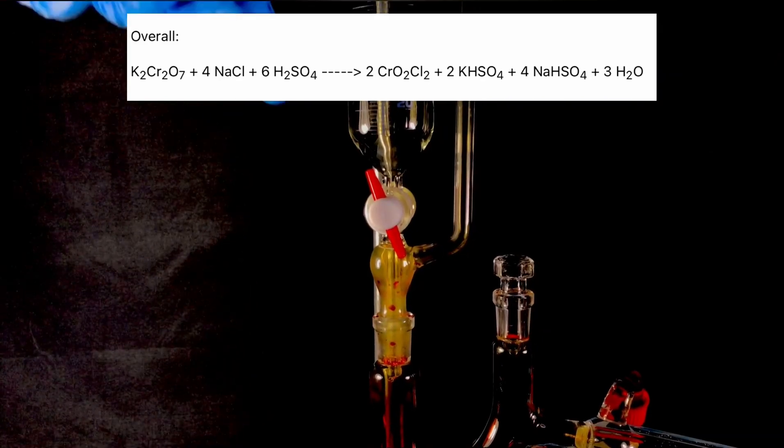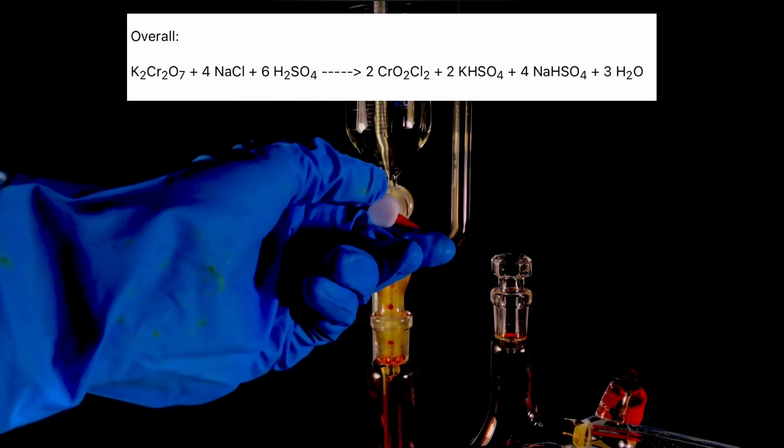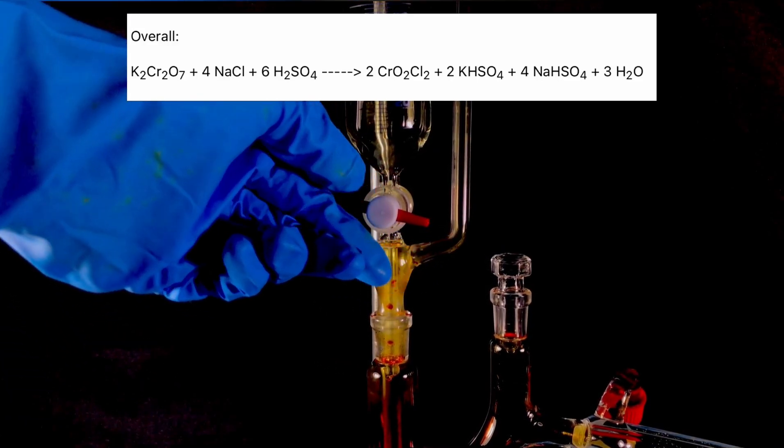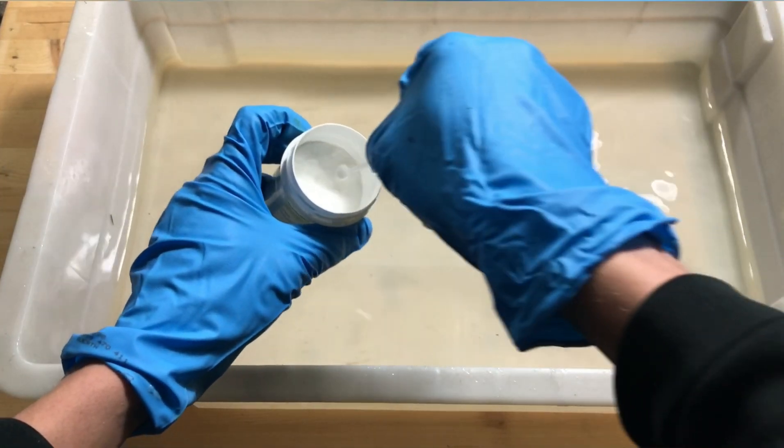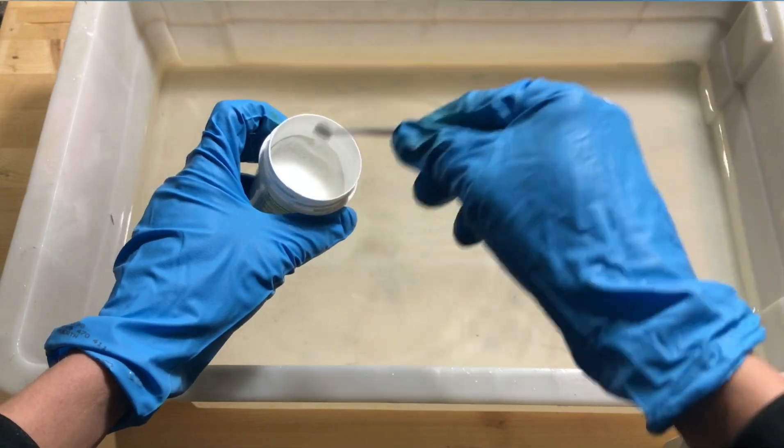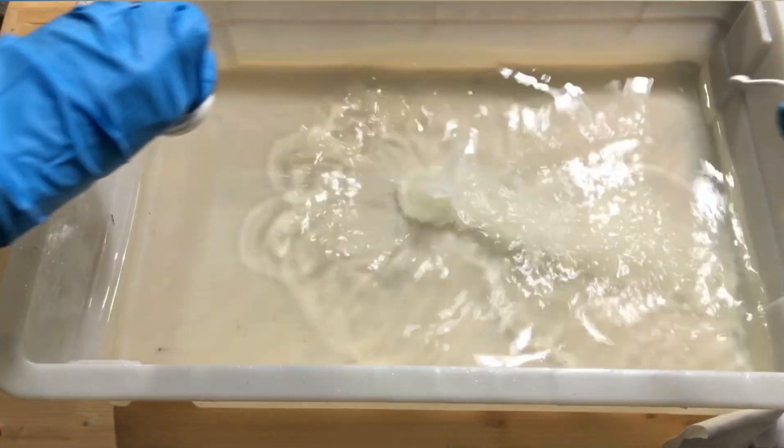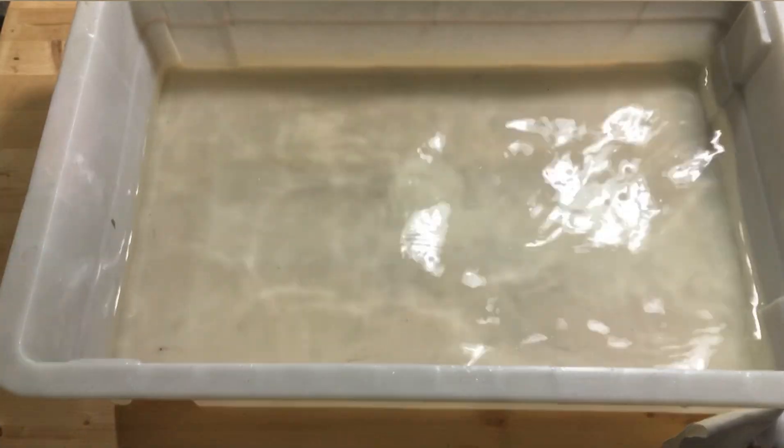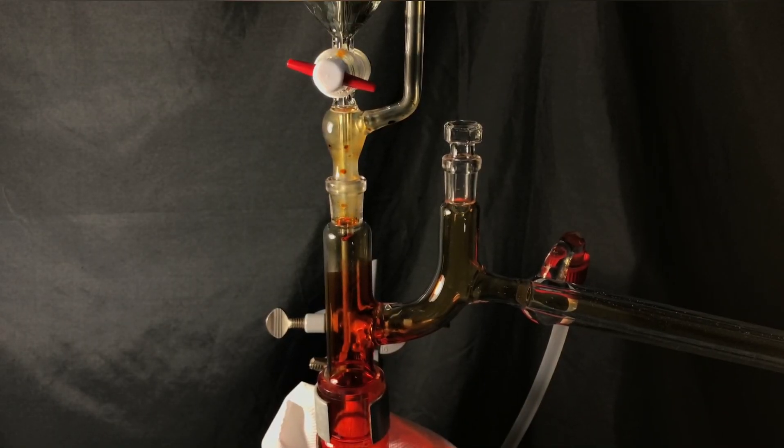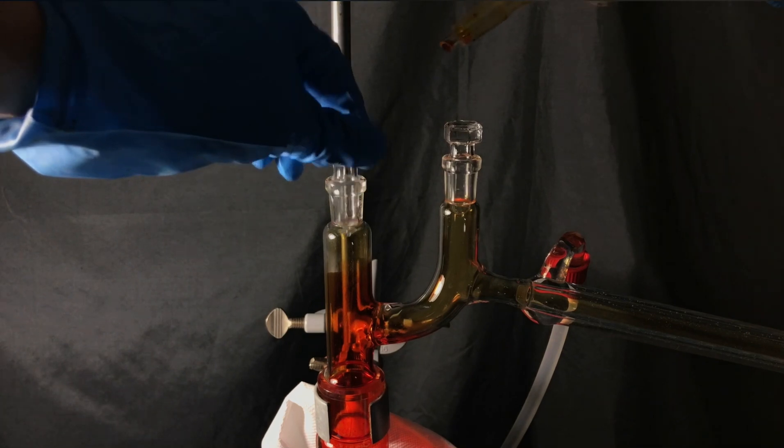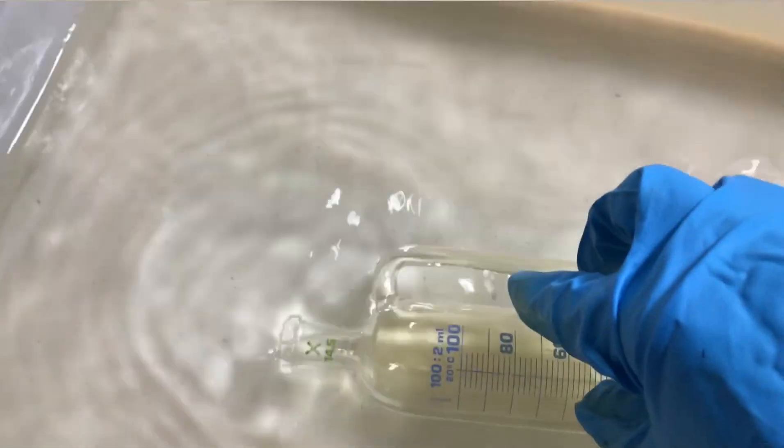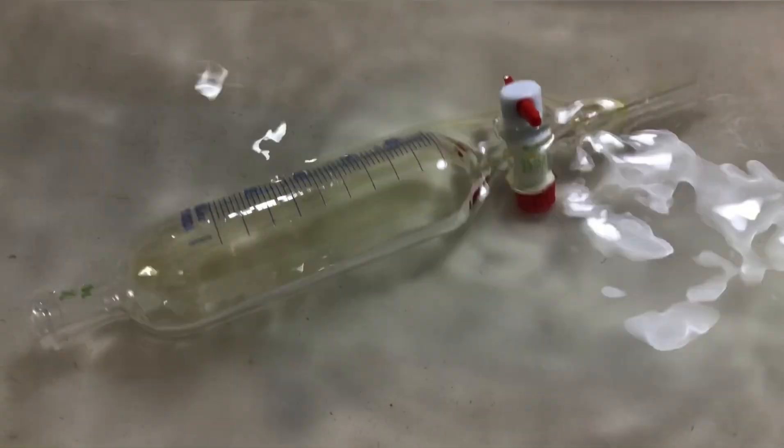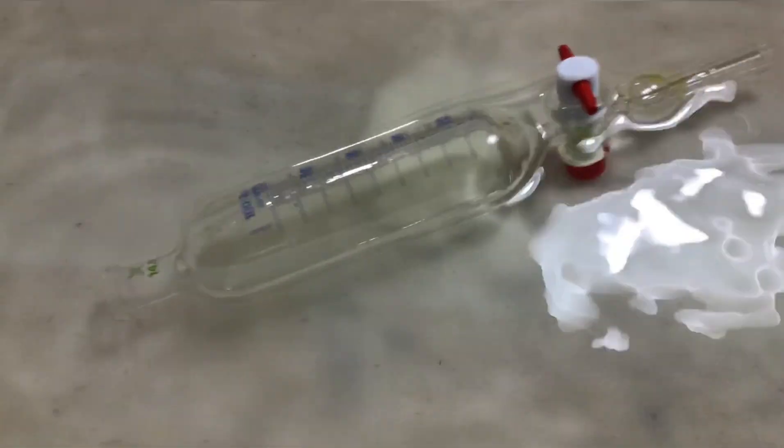All of the sulfuric acid has been added. The addition funnel was closed. Before continuing we set up a reducing bath to destroy any hexavalent chromium. As a reducing agent a small amount of ascorbic acid was added. Sodium sulfite could also be used. The addition funnel was swapped out for a well-greased stopper. For cleanup the addition funnel was put directly into the reducing bath. I let it sit there for at least 10 minutes before continuing with the cleanup.